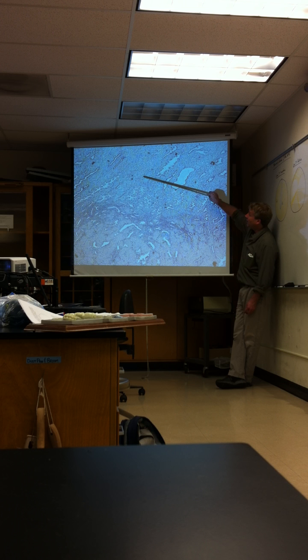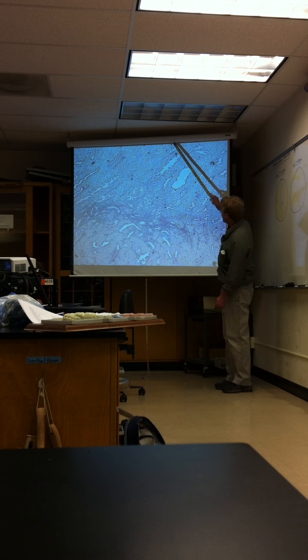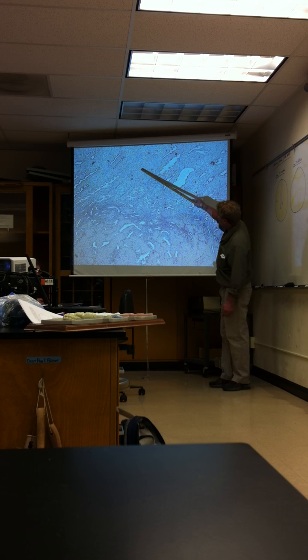And then identify the specific layer right here. Specific layer is stratum functionalis. So you'd want to know the function. It is a site for implantation. You can kind of imagine what happens is that embryo literally will come and burrow itself into this stratum functionalis. So it could end up right there.